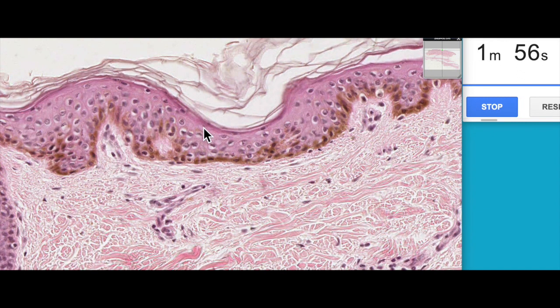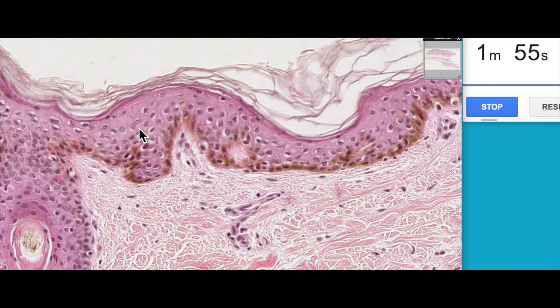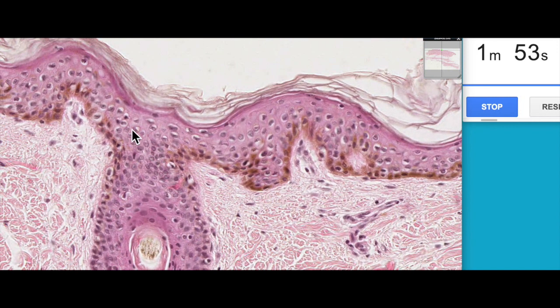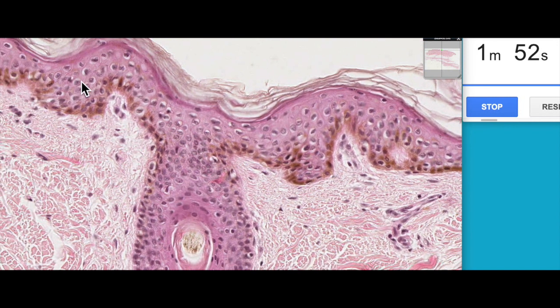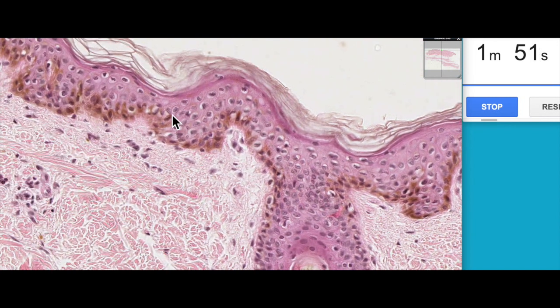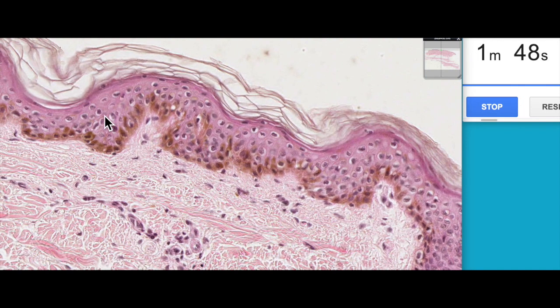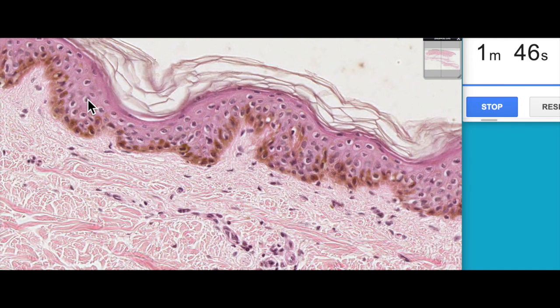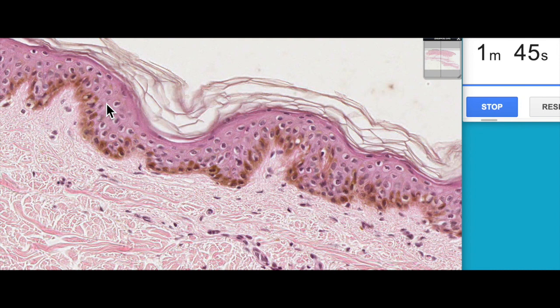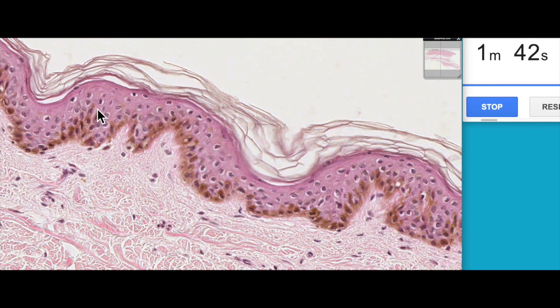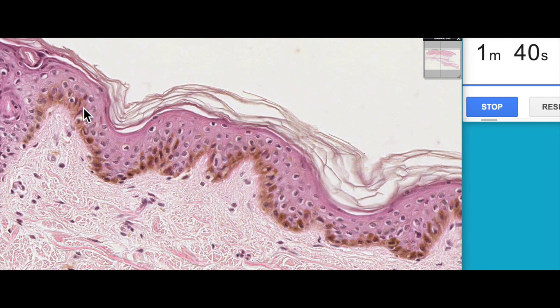Then we have the stratum spinosum. You can see the cells are quite pale, and obviously this is an artifact related to fixation. What it does do is make identification of the Langerhans cells within the stratum spinosum quite tricky in this type of section.